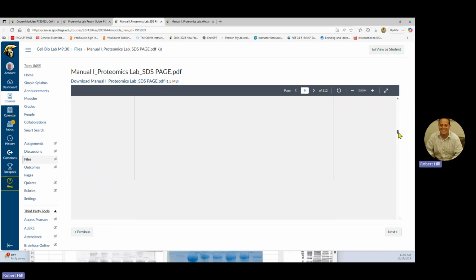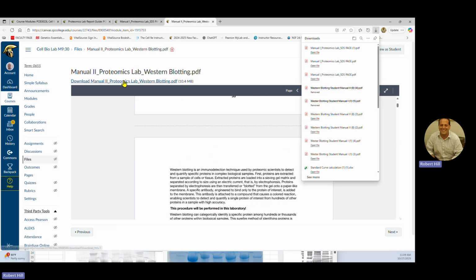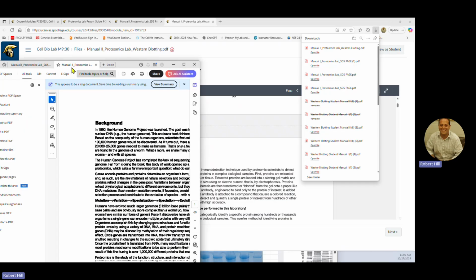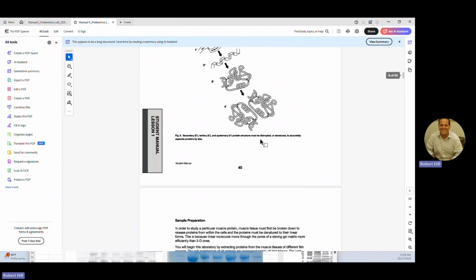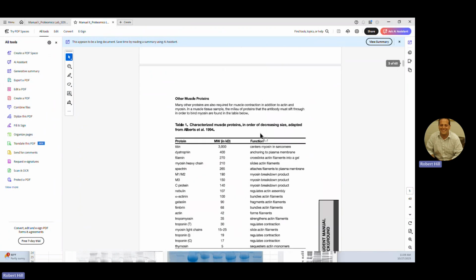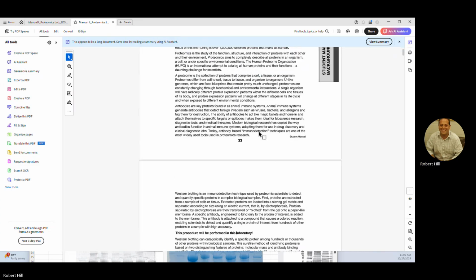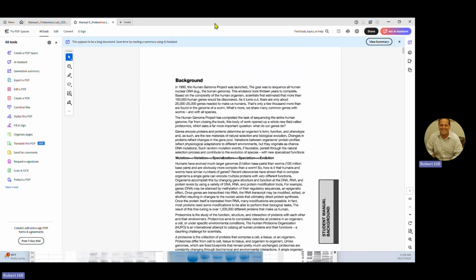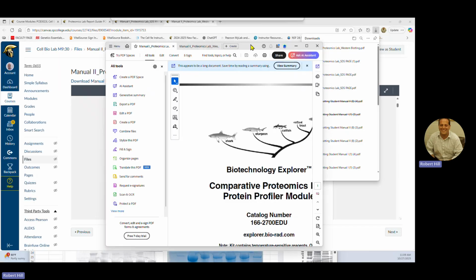So if we scroll down to page 33, I'm going to open this up in a different thing here so I can use it easier. So if I go down to 33, well, this is the wrong file. This is the right file. Wait, is this number 2? That's 2, I'm sorry. All right, bear with me, lots of files.